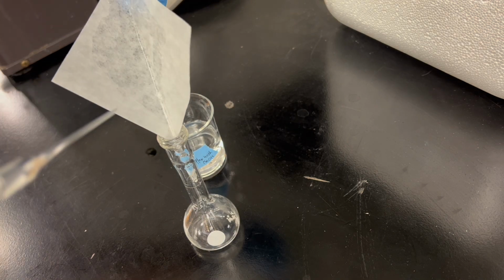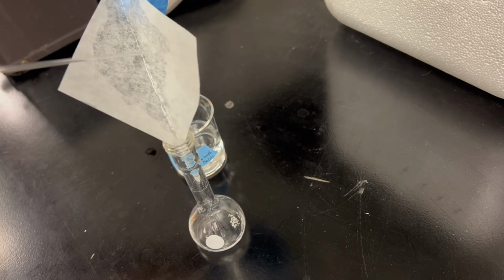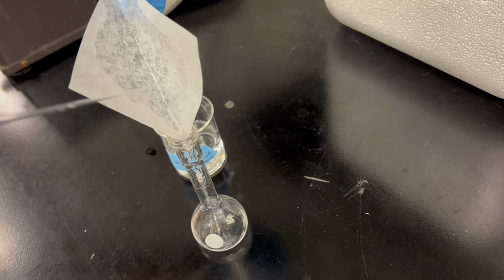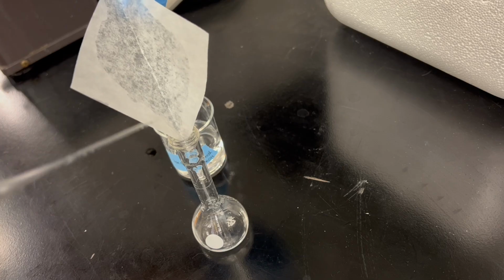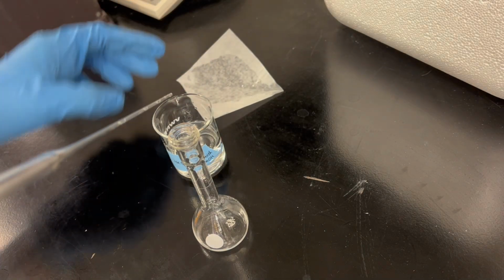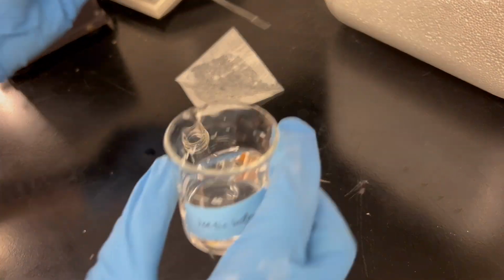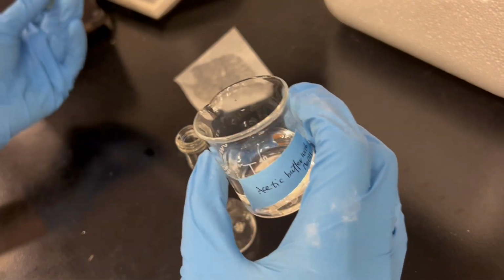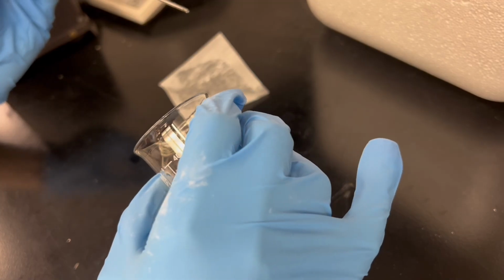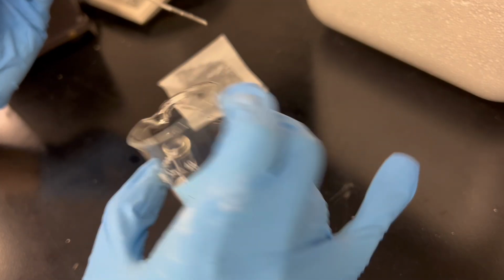flask and rinse it with the solvent. This step could help us avoid or minimize the reagent loss, so make sure to do it. And then fill it, but make sure to stay below the line, because the next step is to degas the solution before we add PFAS to it.